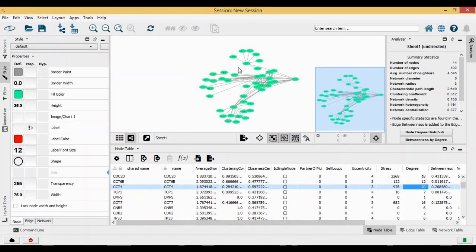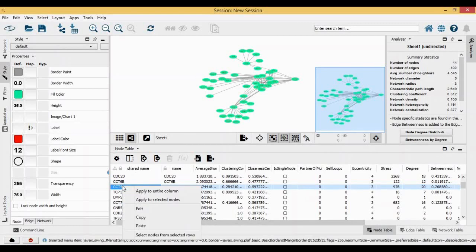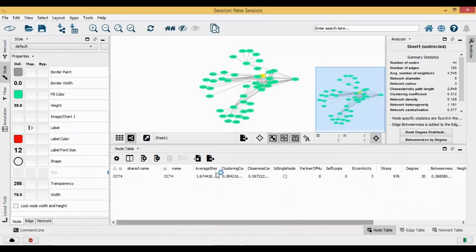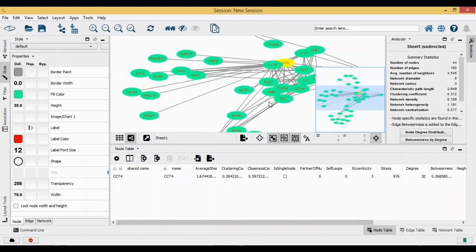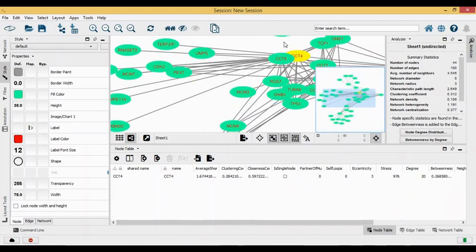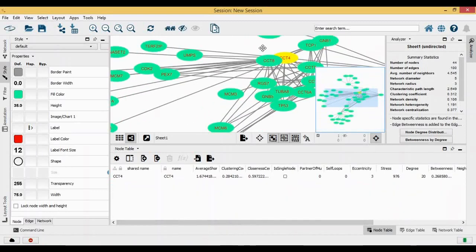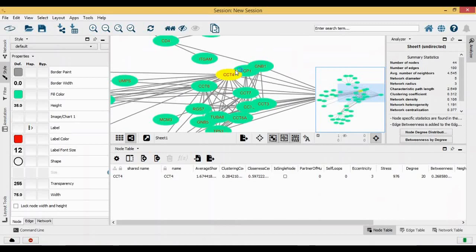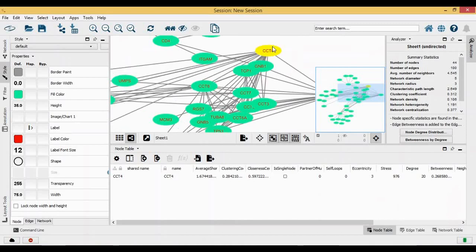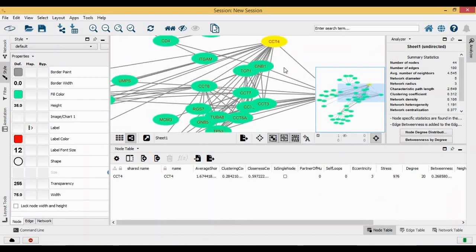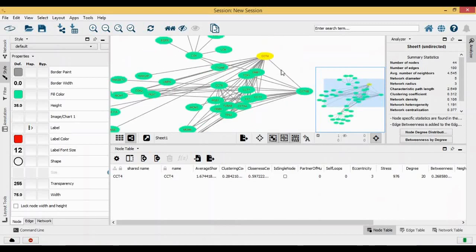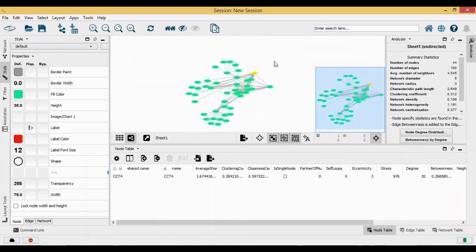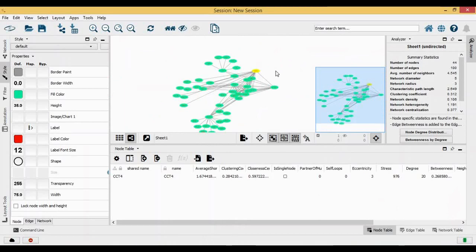If I want to find out which is this gene present in this entire network, I can right-click here and say select nodes from the selected rows, and you can see that CCT4 has been highlighted.